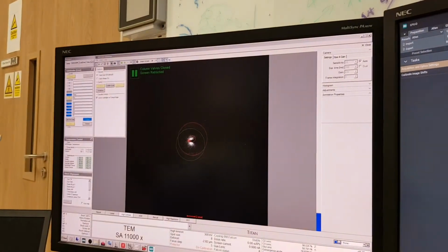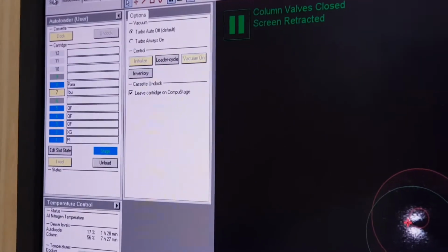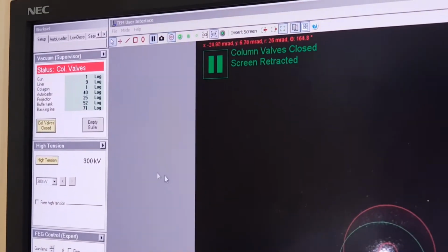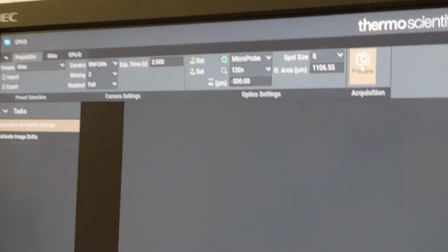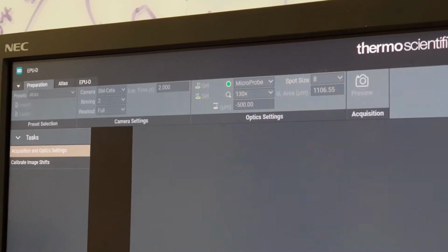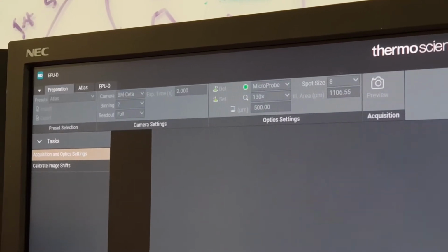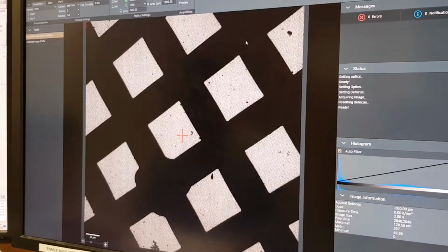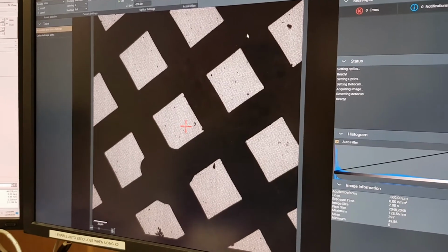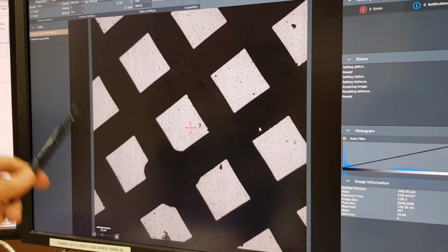And in this test, I have loaded the small drug target we call eptofen. It's already loaded into the microscope. So first, let me open the column valve. Then we can acquire one Atlas image as a preview. Here we have the Atlas image. It's just an overview of the entire grid. You can see some grid squares with some dense particles.